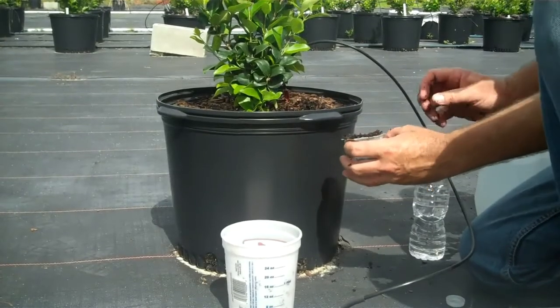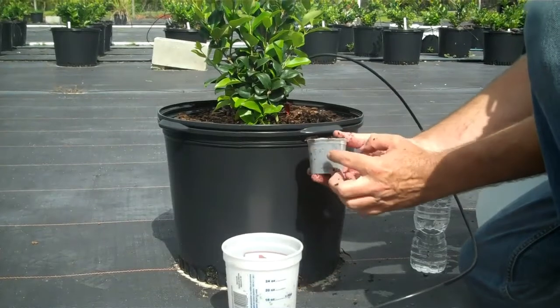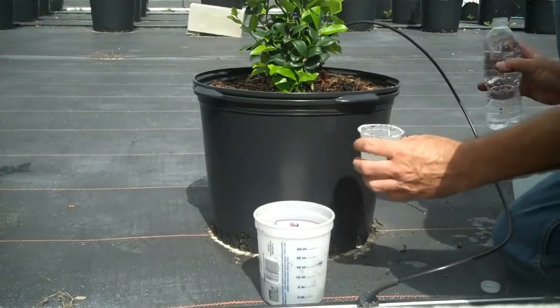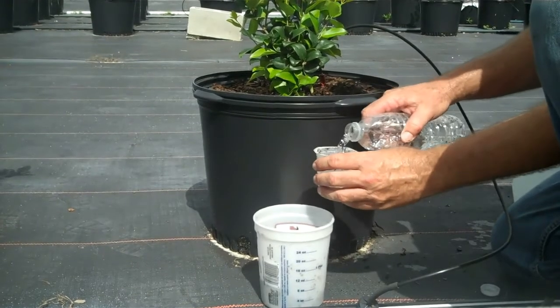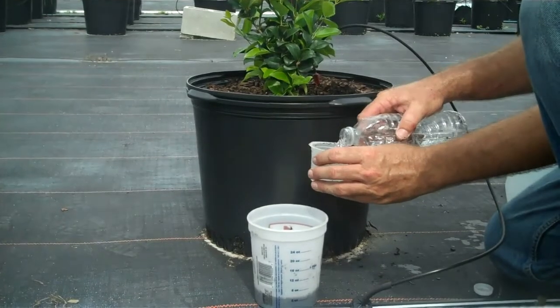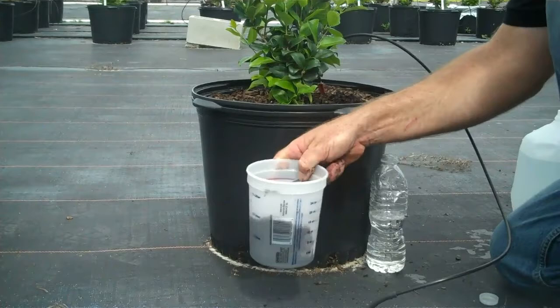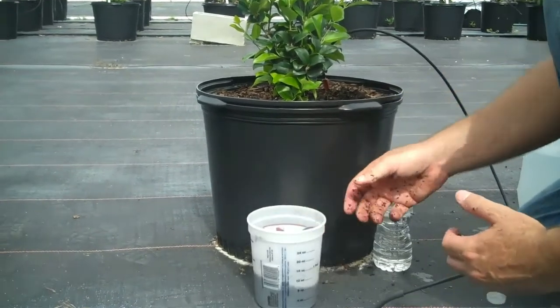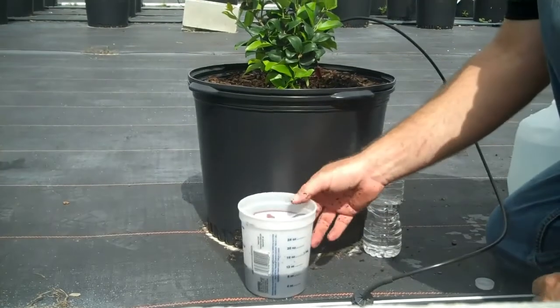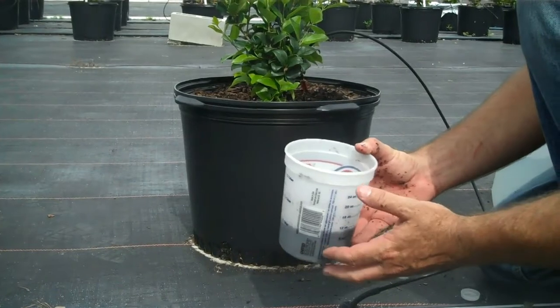Here we're going to talk about the 2-to-1 method of measuring pH and EC. What you're going to do is take 1 volume of soil and 2 volumes of water. Make sure you're using the same volume container. You're going to make sure that that's good and mixed, and you're going to let that sit for about 15 minutes. After about 15 minutes, you can put this slurry into your pH or EC meter and get a reading.